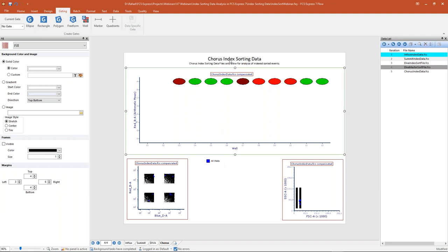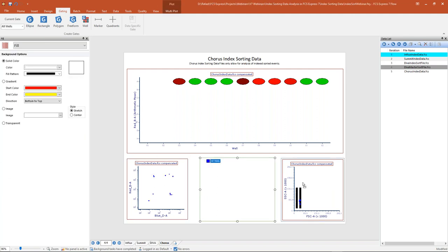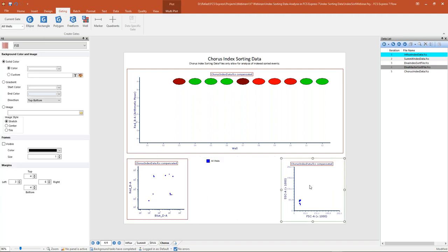Once we've created our all wells gate, we can come in here and apply that gate to my two plots to the left and right. Now we're focusing only on our index sorted events on these plots. That's how we want to work with this Chorus data — create well gates and apply those gates to our plots for further analysis of our samples.